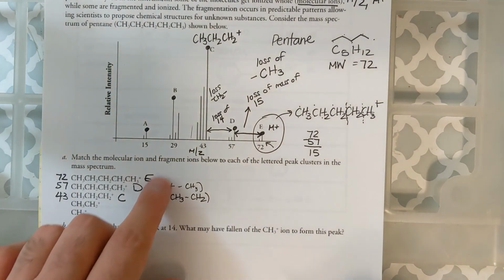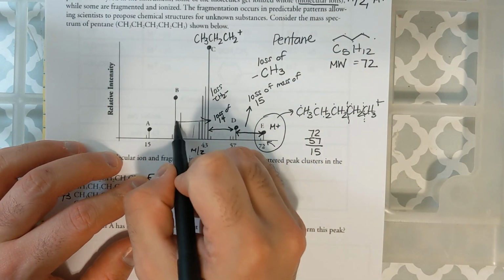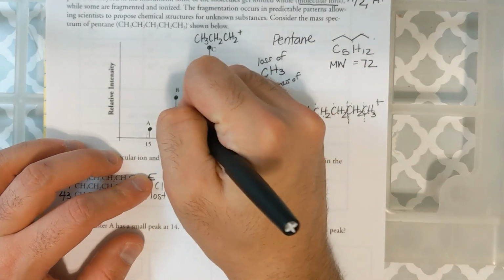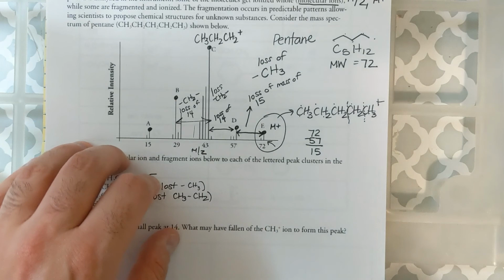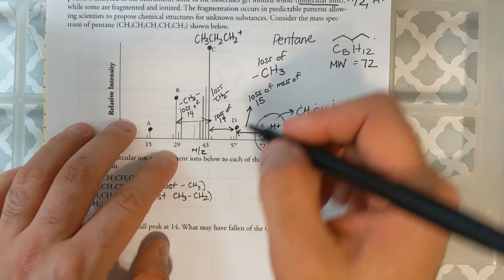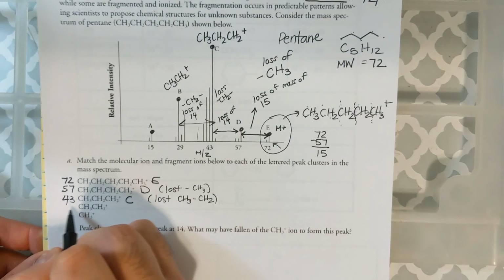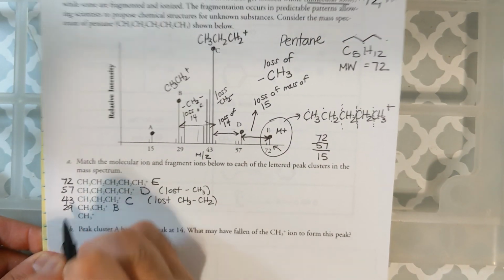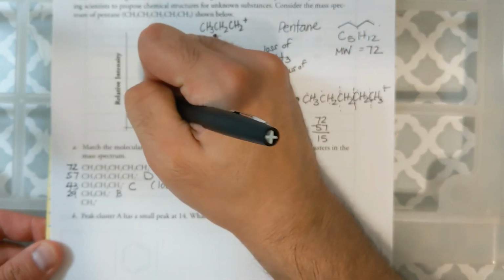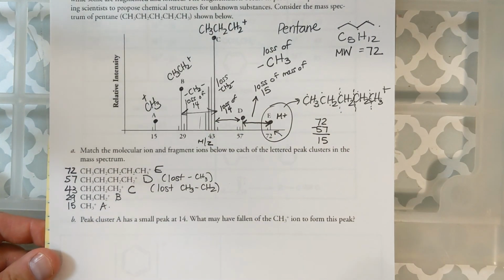Continuing on, going from 43 to 29, you've guessed it, that is another loss of 14, which is another loss of CH2. If I lose another CH2 at this mass of 29, I must have CH3, CH2 plus at peak B. This is peak B. That has a mass of 29. And then you've guessed it, if I have a mass of 15, I must have CH3 plus. This is a mass of 15, and that is peak A.